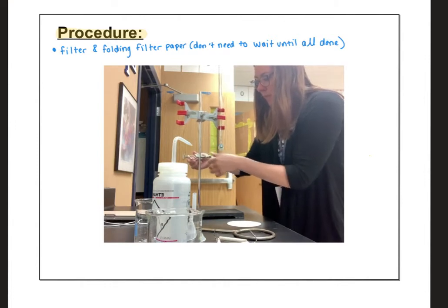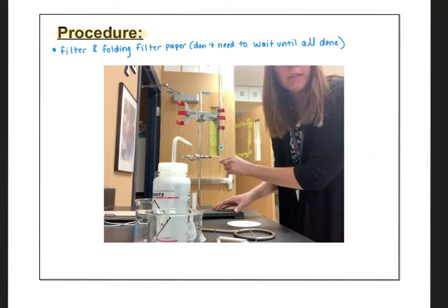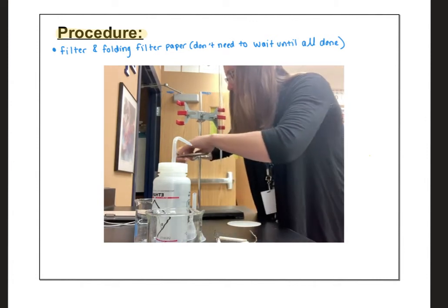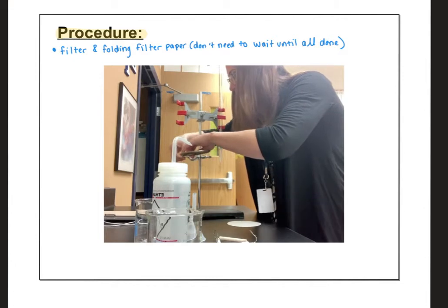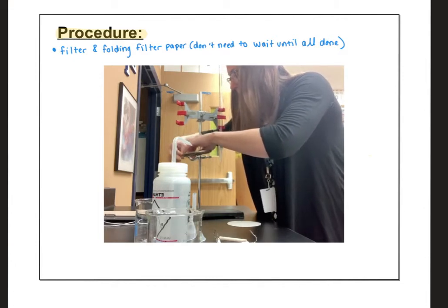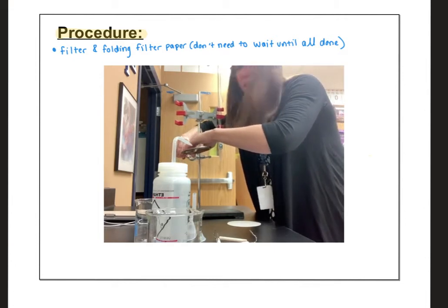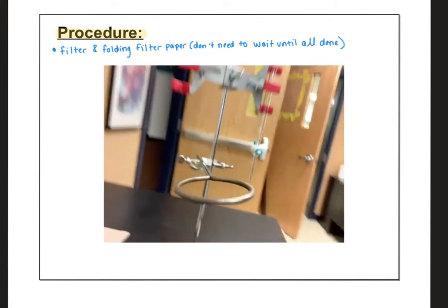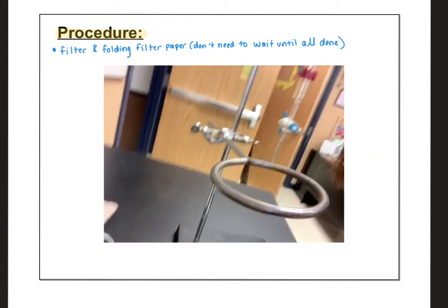You always want to be careful when you're doing multiple things. Just be careful of this burette tip. It's very gentle, or be gentle around it. It could break easily. And then on the other side of the clamp, I'm going to attach the ring. So you can see it's held on nice there, screwed in tight.